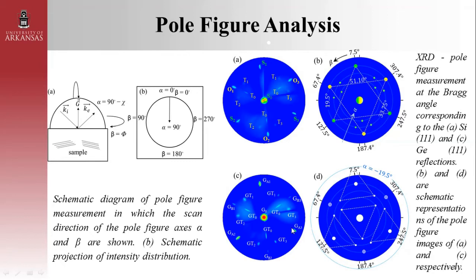This reflects that the epitaxial germanium 111 layer is predominantly of type A stack with respect to the silicon 111 substrate. So it can be concluded that the type B regions represent rotational twins formed due to a 180 degree rotation of the 111 plane about the 111 normal twin axis.